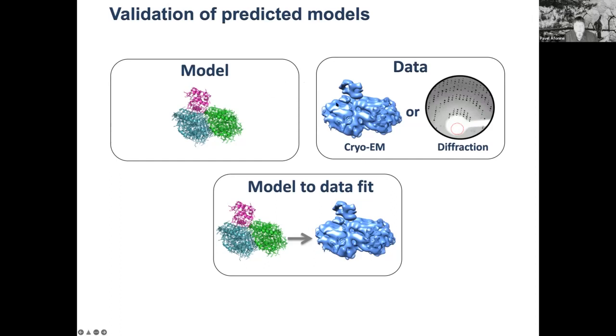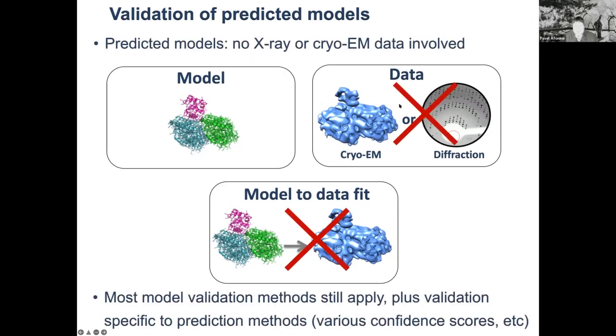Now, again, in the case of our usual scenarios, we have cryo-EM or diffraction data. But now, if you have a predicted model, you don't really have diffraction data. You don't really have cryo-EM data.